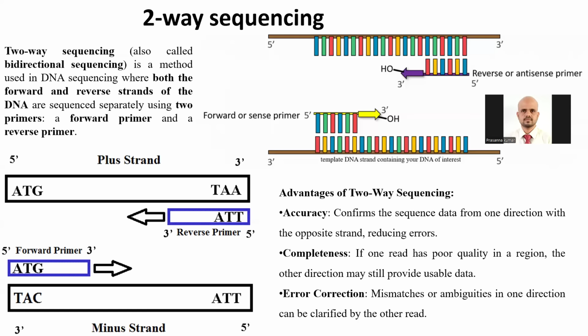So you should know, when you submit a sample to the company, they isolate DNA, go for PCR, then if necessary do PCR purification, then go for single-strand PCR, where your sample is split into two single strands. In one PCR tube, only the forward primer is added. In another PCR tube, only the reverse primer is added. That's how single-strand amplification is facilitated.